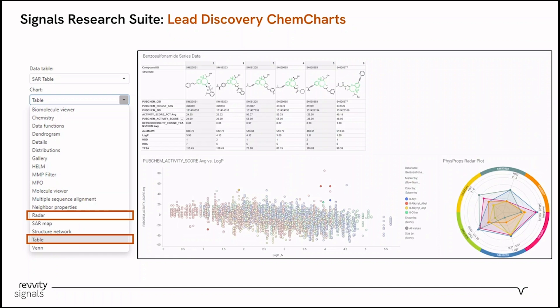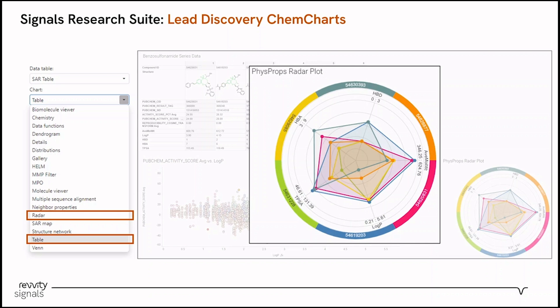This view combines a chem charts table with a standard scatter plot and a chem charts radar plot. And what's nice is these all interact with each other. Here I've highlighted a few compounds — they show up in the table as well as in the radar plot, where just like with the MPO, I got to choose which properties form each axis of this web-like plot. And then each of the compounds I selected is overlaid in a different color, so we can easily compare across our data set.